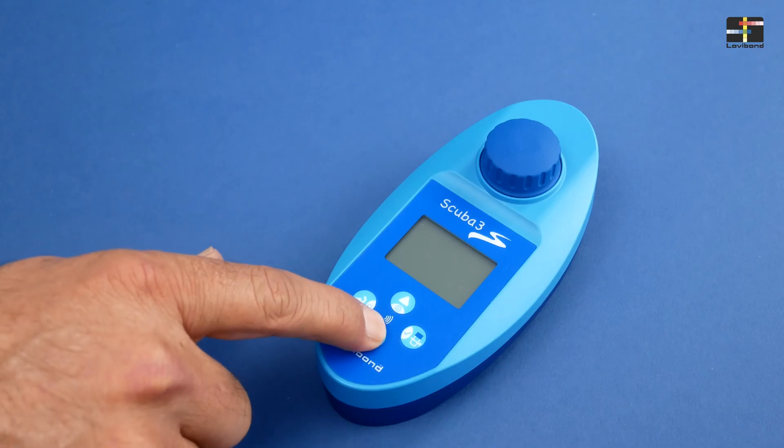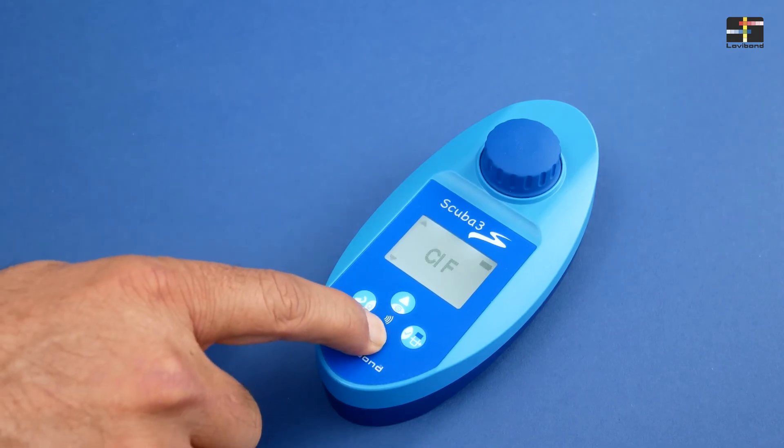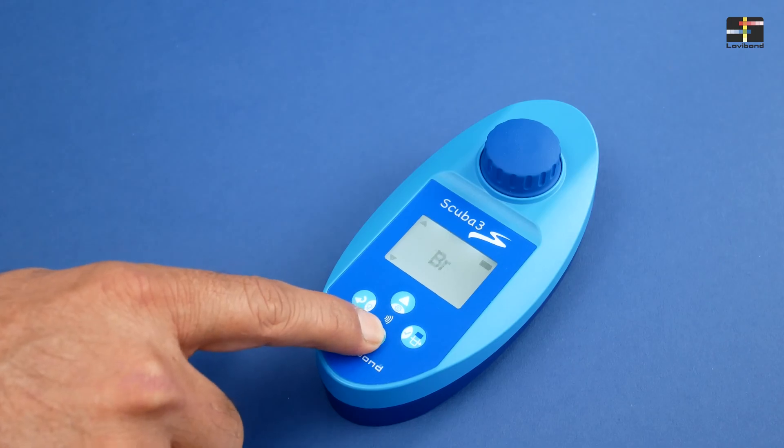First of all, switch on the device and you will see the last used test on screen. Scroll up or down to display your desired test and press test key to confirm selection.